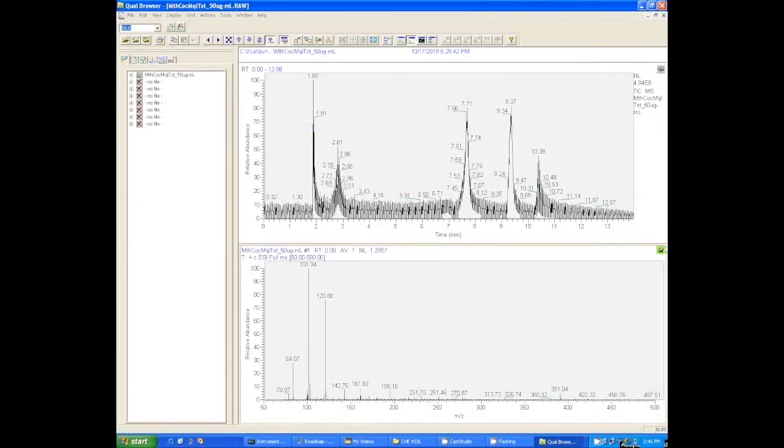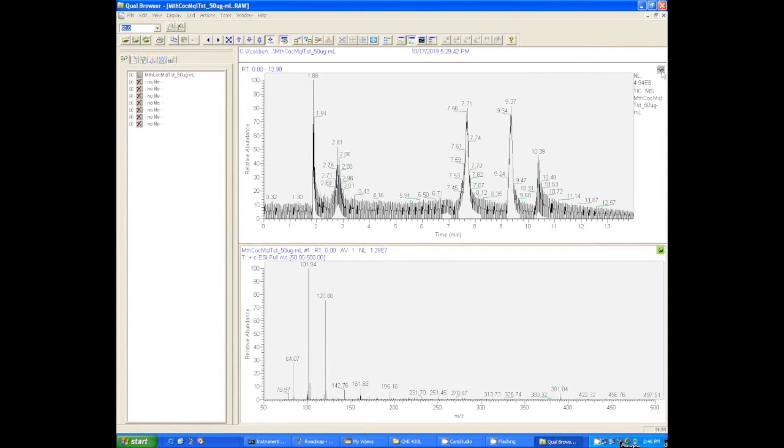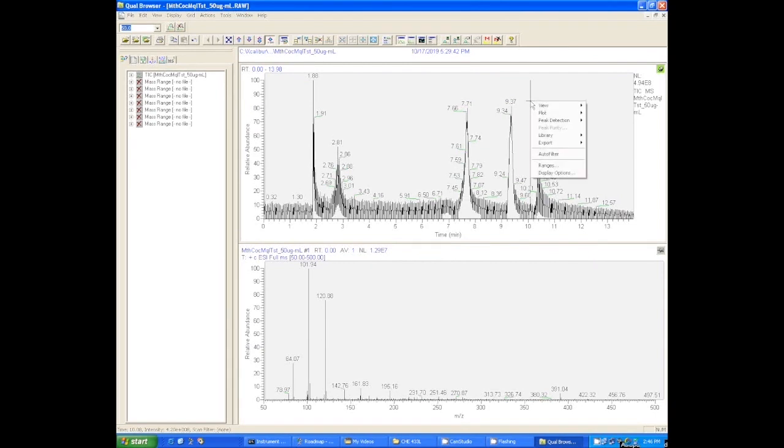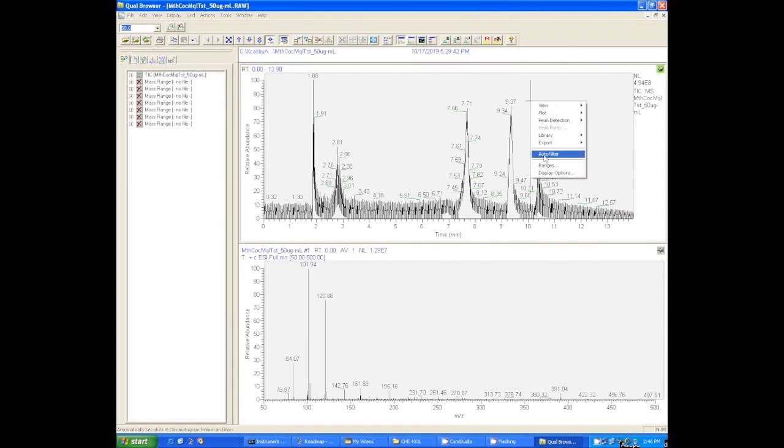Let's look at the data we get from this MS/MS data-dependent run. When you first open it up, it's not going to be very useful because it actually has several pieces of data piled on top of each other. You need to separate these out. The way that you're going to do that is you're going to right-click on the chromatogram and select the auto filter option, and that's going to separate all the different chromatograms that it acquired.